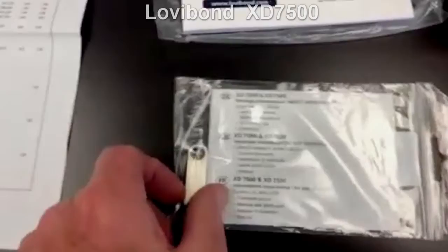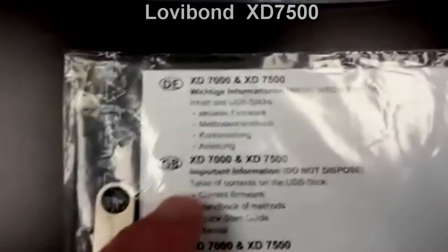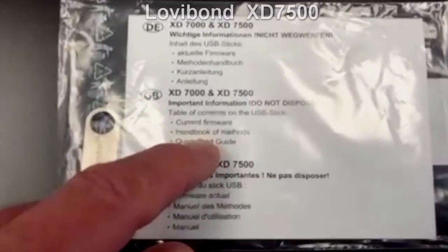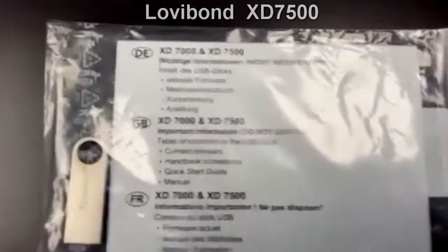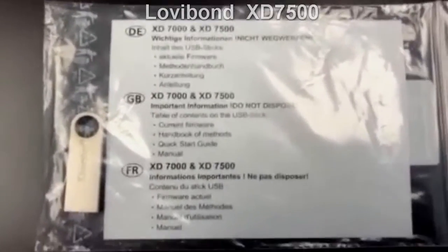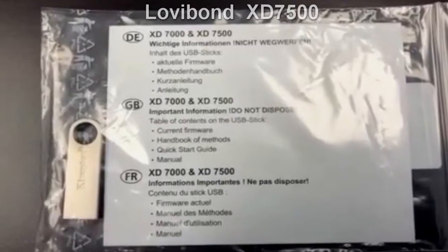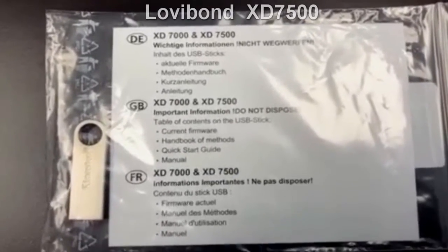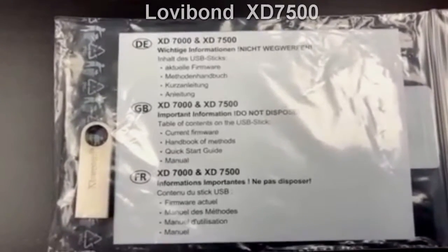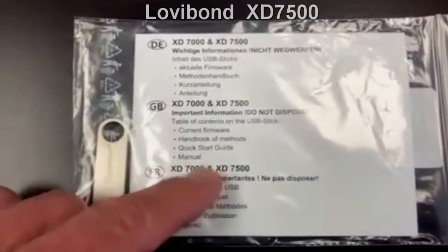You also get a bag of tablet crushers and stir rods. And then an interesting item: you get a small USB stick. On that USB stick you get the current firmware of the instrument and our handbook of methods. For those not familiar, the handbook of methods is a compilation of all the different analysis methods for Lovibond products. It gives you important information — not only how to conduct the method, but also information on interferences, minimum detection limits, and things of that nature. Also on this USB stick is a quick start guide and the full comprehensive manual.